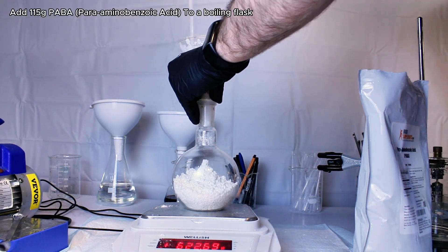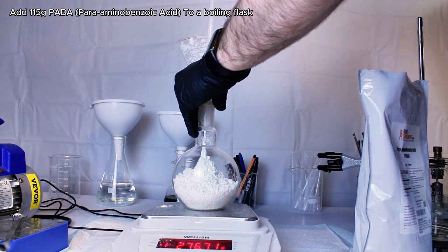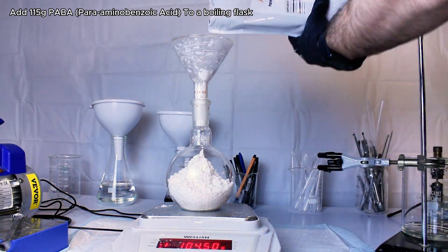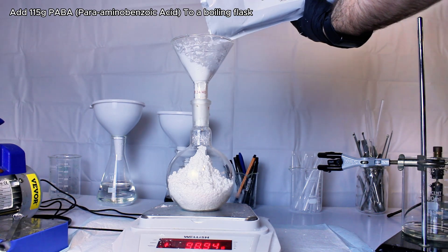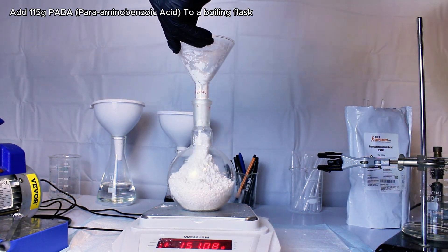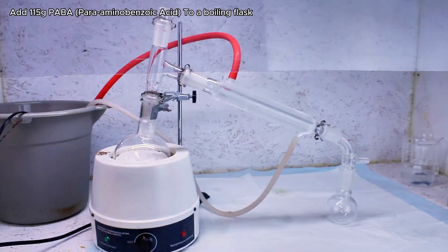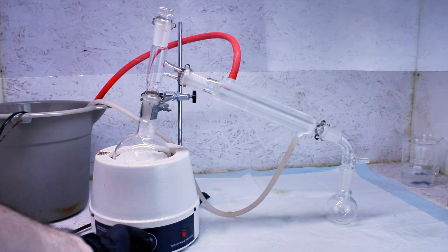To get started, I add 115 grams of PABA to a boiling flask. Initially I only added 100 grams, but added 15 more off camera once I realized I could pack it down somewhat. This was then set up for a basic distillation and heated at my heating mantle's maximum temperature.